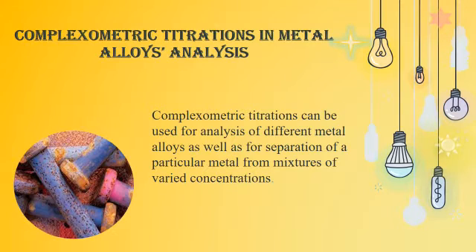The complexometric titrations can also be used for analysis of different metal alloys as well as for the separation of a particular metal from mixtures of varied concentrations.